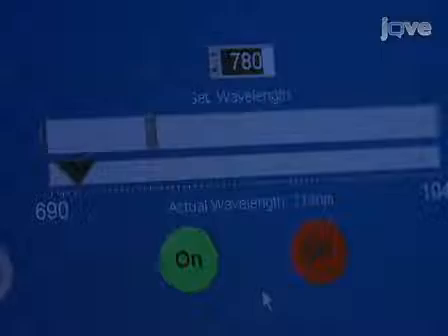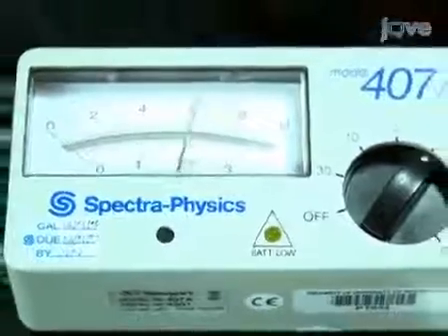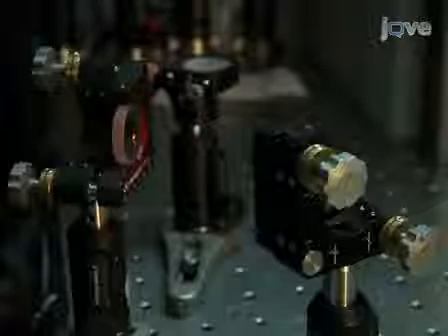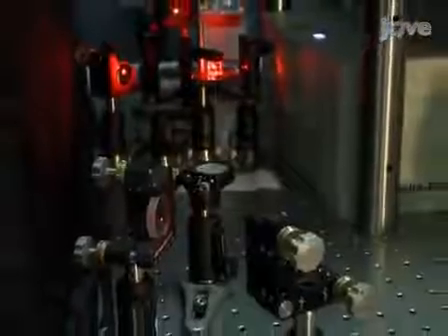To begin, set the desired laser wavelength and insert the appropriate filter in front of the photomultiplier tube, or PMT. Next, to avoid damage to the Pockels cell, adjust the laser power to 200 milliwatts or less. There are two mirrors, oriented in a figure 4, upstream of the Pockels cell. These mirrors are necessary and sufficient to align the laser beam through the Pockels cell.